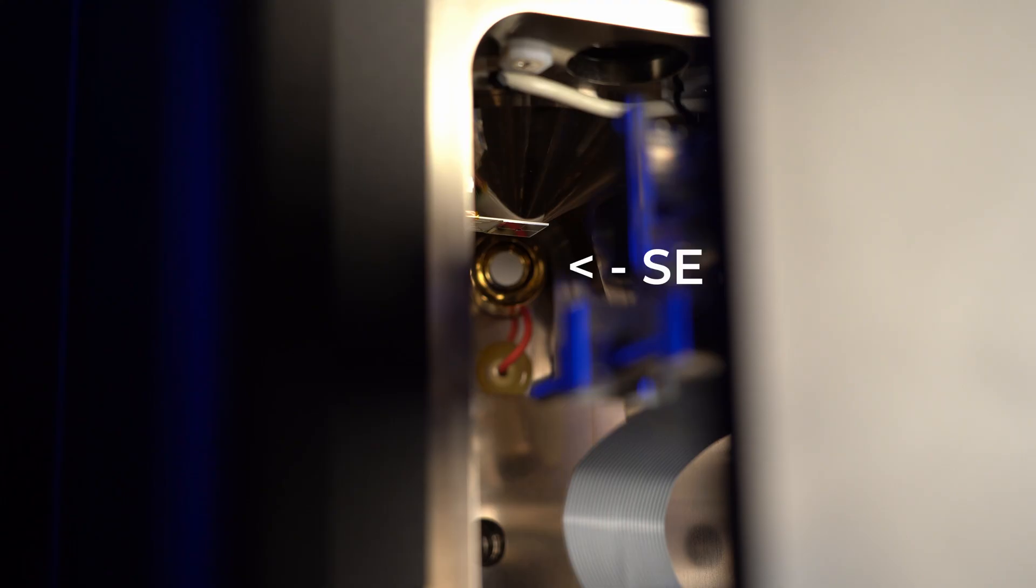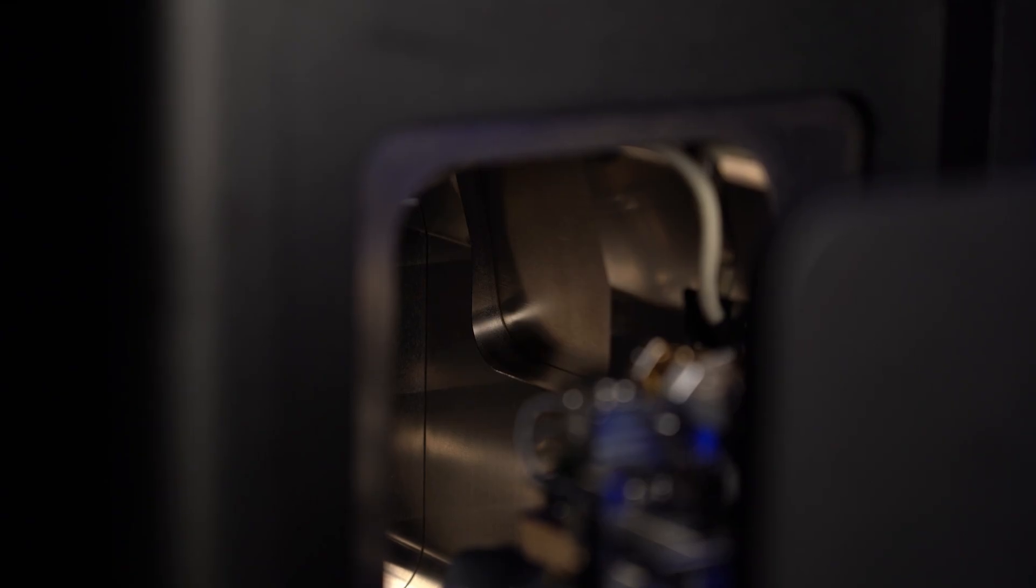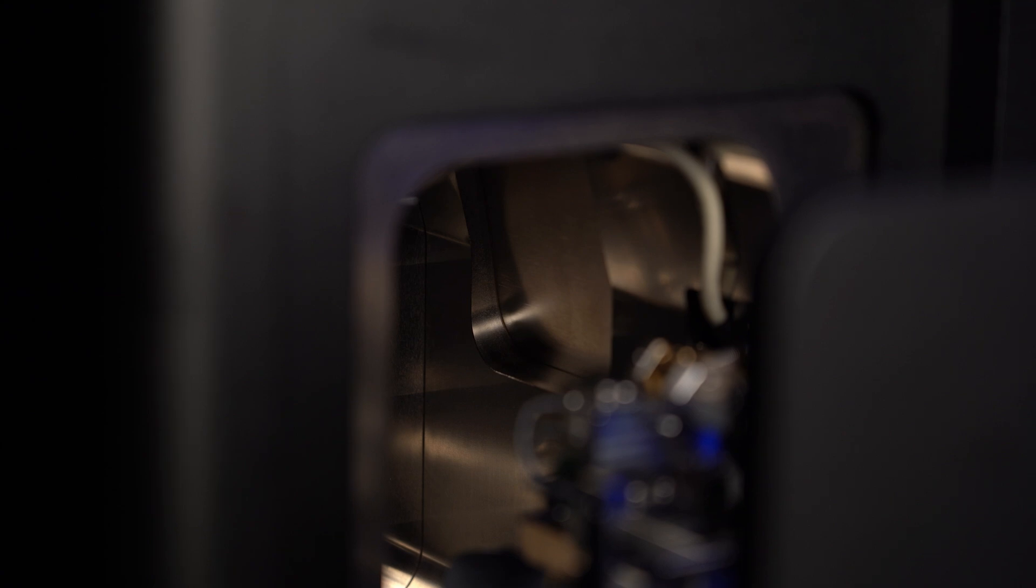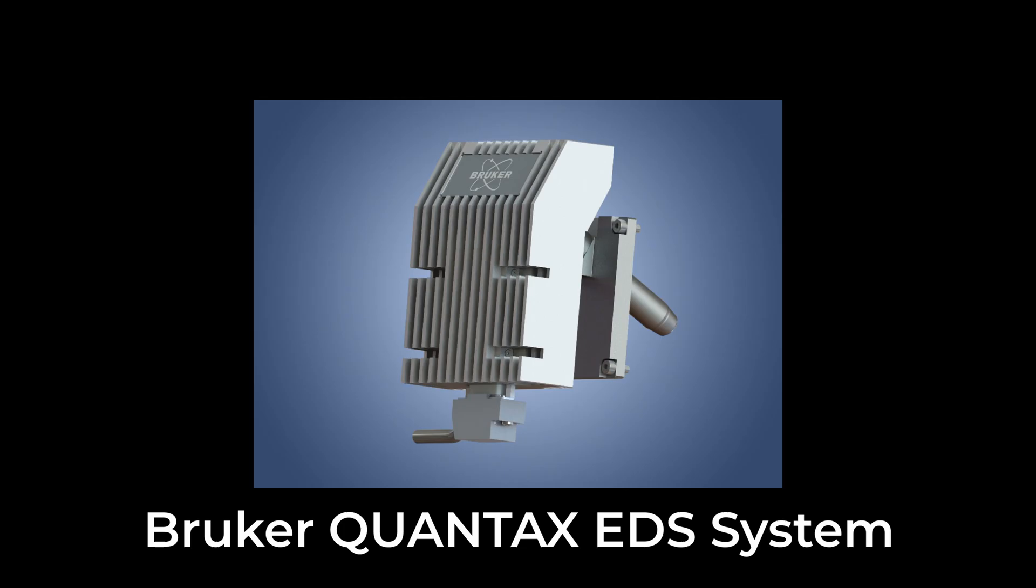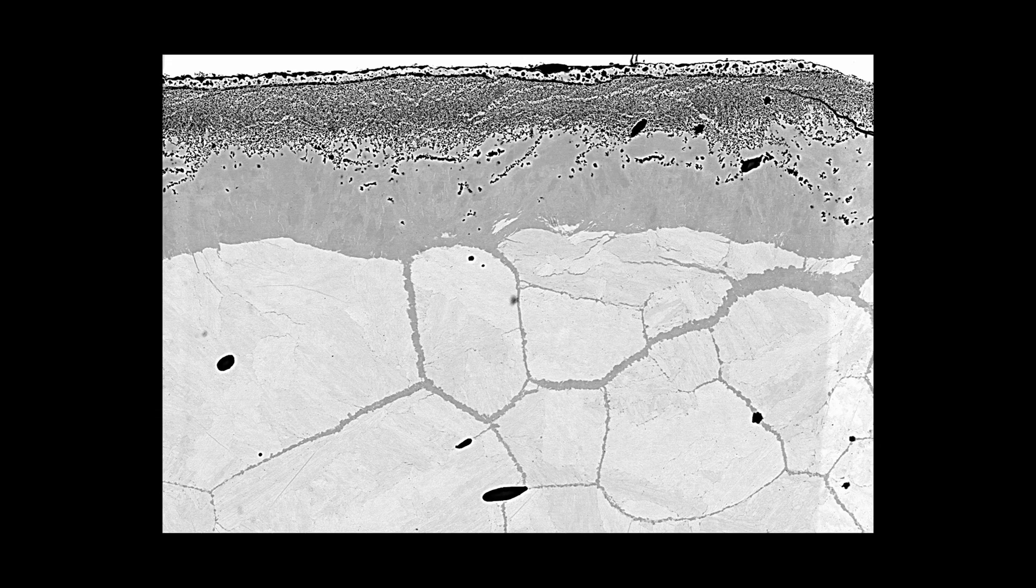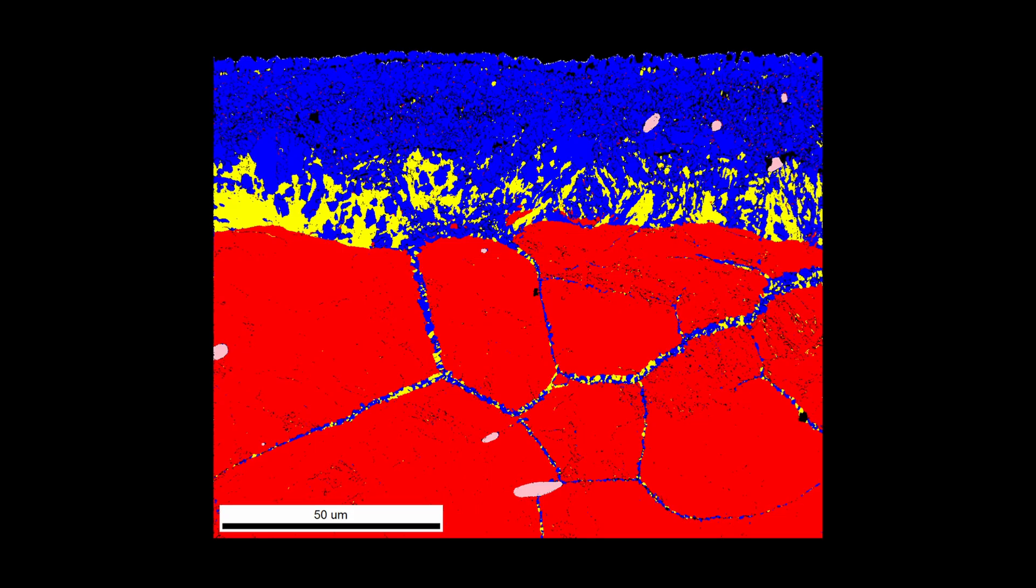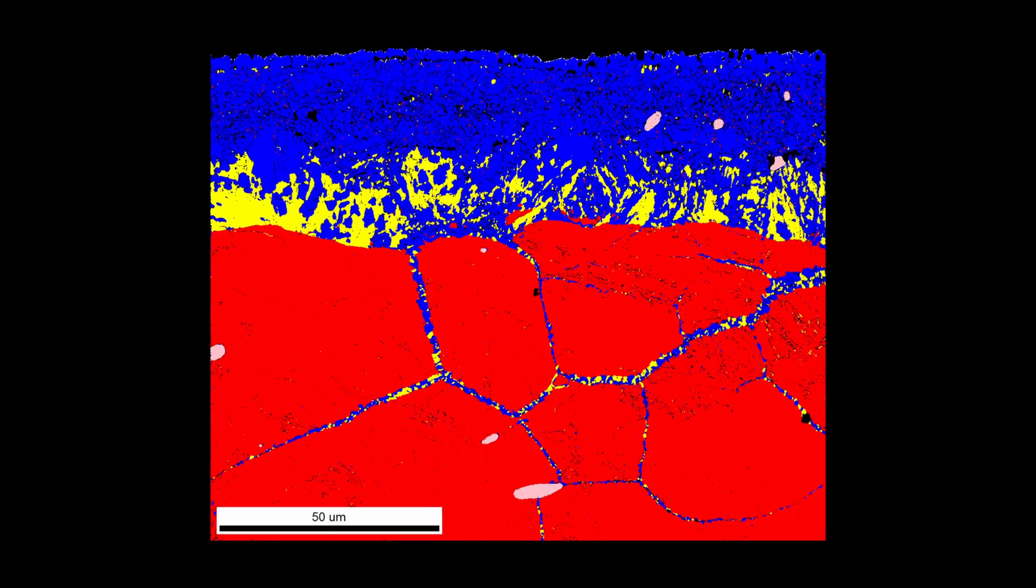In the chamber you can see secondary electron and backscattered electron detectors. Also we have a port for EDS detector installation, but spectroscopy is the long story, so we'll dive into it in future episodes.